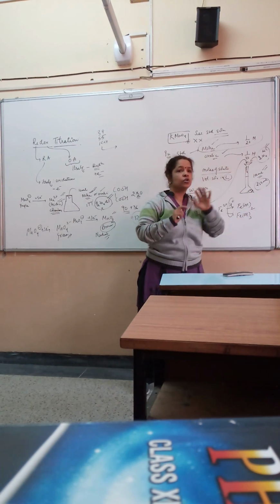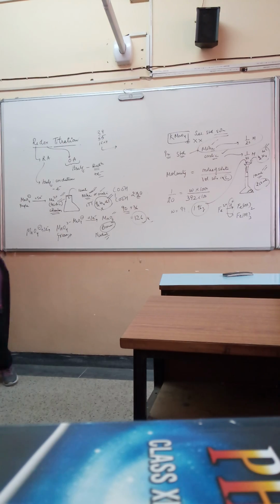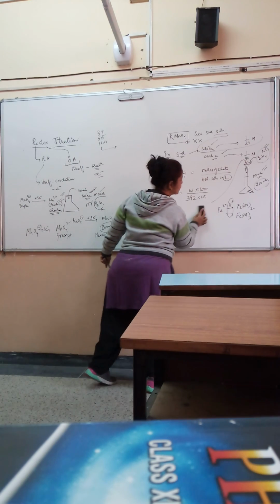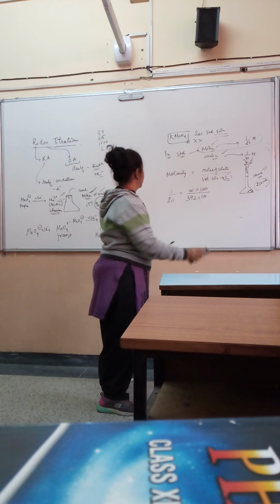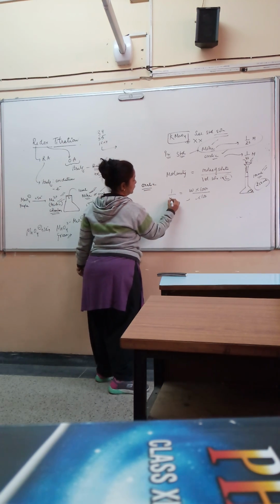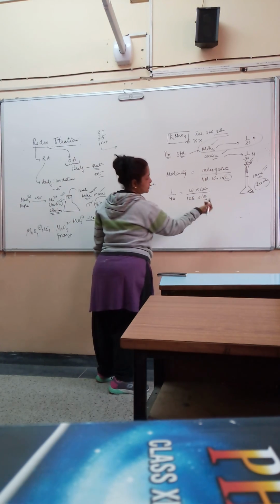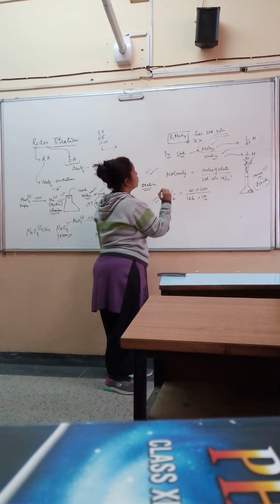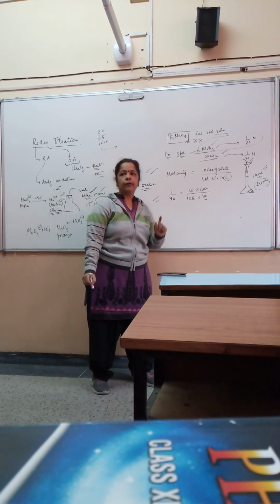This dilute sulfuric acid is not required if you are preparing oxalic acid solution. The only difference when you prepare oxalic acid solution would be that your values here would change and you do not require the sulfuric acid. Normally the molarity given for oxalic acid solution is 1/40. The mass that you use is 126. This is dependent on your apparatus, what you need. Hence, we prepare the standard solutions of either Mohr salt or oxalic acid in this way. Fine? No problem?